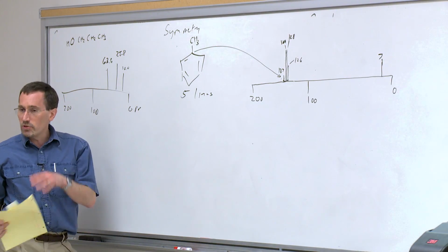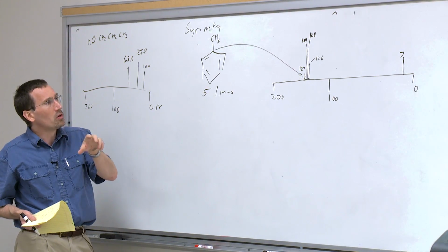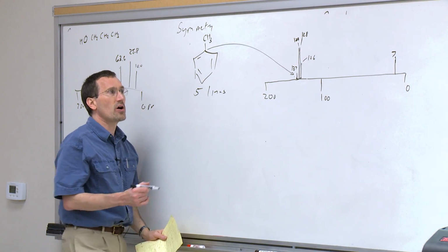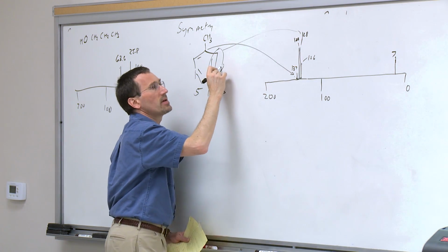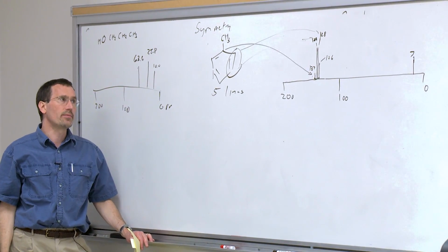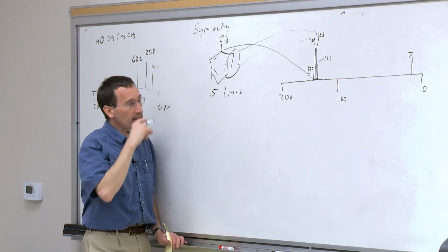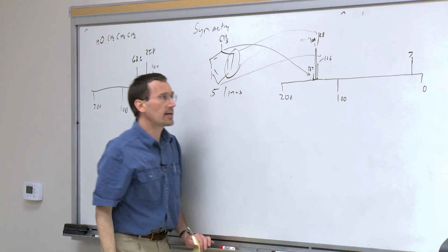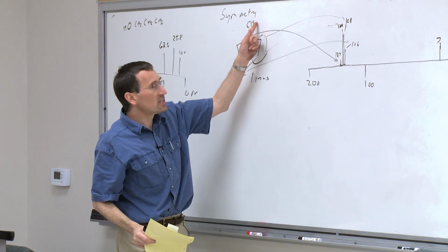Even though we don't use integration in C13 NMR because it's not very reliable, you can often get an idea from the heights of other peaks. Like I can be pretty darn sure that the 128 and 129 peaks, I don't know which corresponds to which, but I can be pretty sure that one of them corresponds to the ortho and one of them to the meta. And then the shorter one at 126, I can be pretty sure that it corresponds to the para carbon.